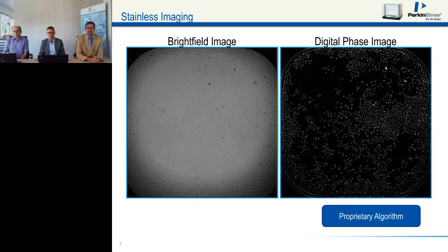This is possible also for microplate readers. Some of you may be aware from microscopy that phase contrast microscopy requires special optics and is sometimes a little tedious to align. In this case, we use a numerical method, which does not require any additional optical elements or a complicated setup of the measurement.